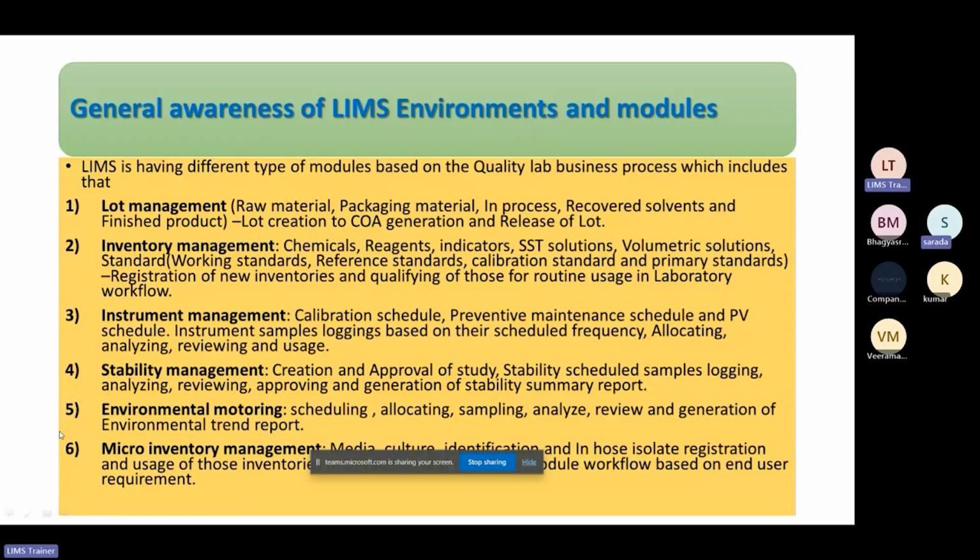Then comes stability management. Do all of you understand what stability is? All of you aware about stability? Yes, sir. If you don't know, let me explain.